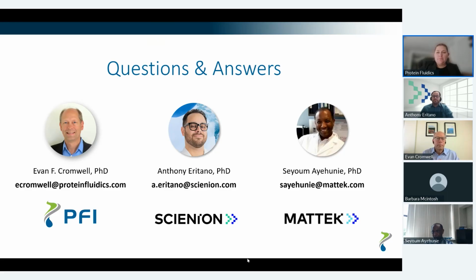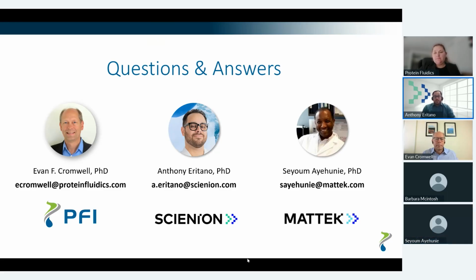Great, thank you. The next question is for Anthony. Will fluorescence capability be available for the spheroONE? The fluorescence capability is actively being pursued, so they are definitely working on that. I don't know a time frame, but it is high on the priority list of things that we are looking to add to the spheroONE to improve its functionality.